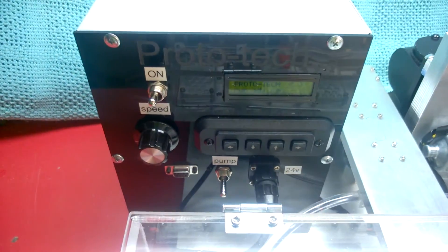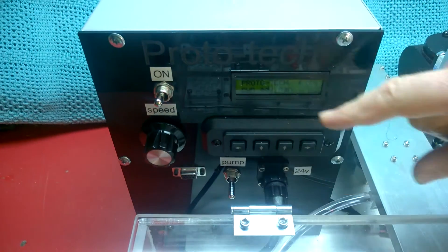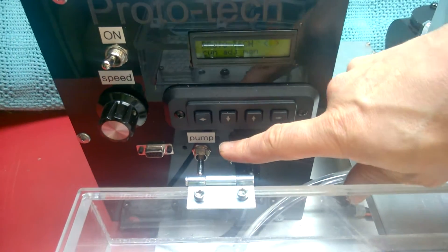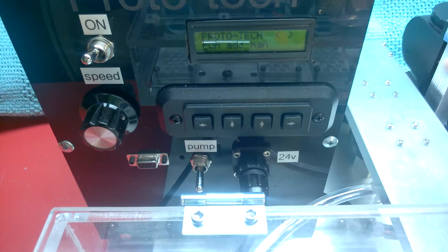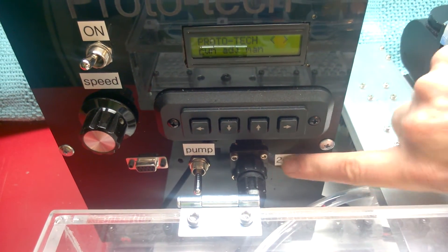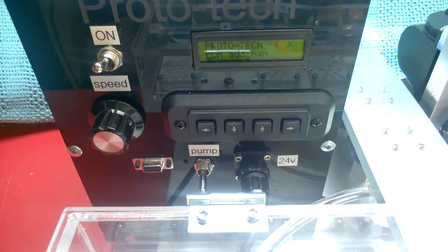Here's the on button. See the speed control. That's for programming. And that's the power to the pump, recirculating pump. Here's an optional 24 volt out to powered brushes.